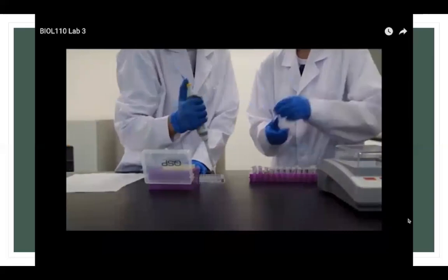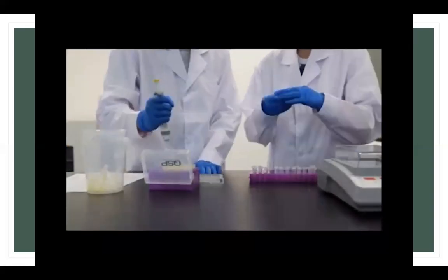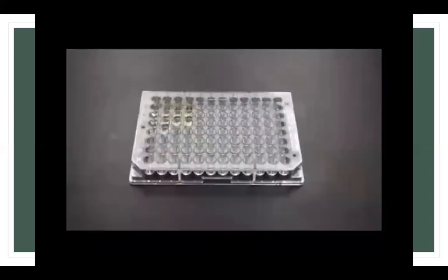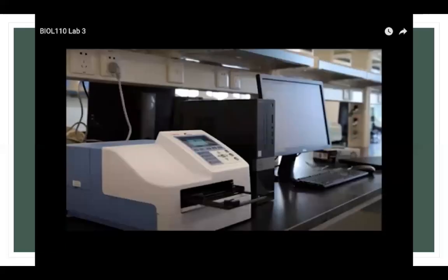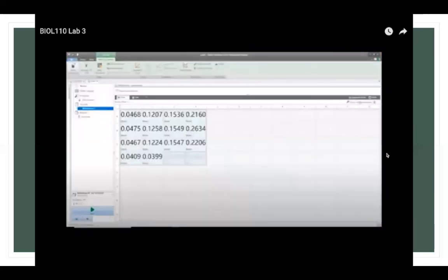Pipette 200 microliters of the reaction content from each tube into the wells of a 96-well plate. Here is the finished 96-well plate containing 2 control groups and 12 tubes of 4 test groups. The color gradually changed to yellowish. Finally, put the 96-well plate into the microplate reader and measure the absorbance at a wavelength of 450 nanometers.